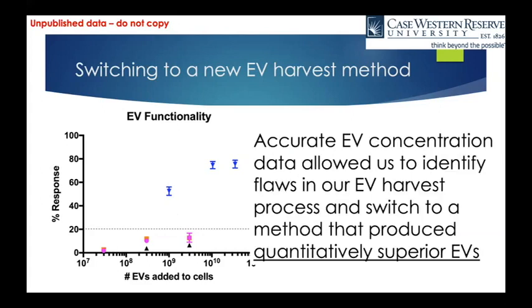And we were only able to do so and figure out there was an issue by, again, getting accurate EV concentration reads using an instrument. In this case, we used the NCS1. So this is just a good case study of how knowing the concentration was really important to improve our research and make our data look a lot better and tighter.